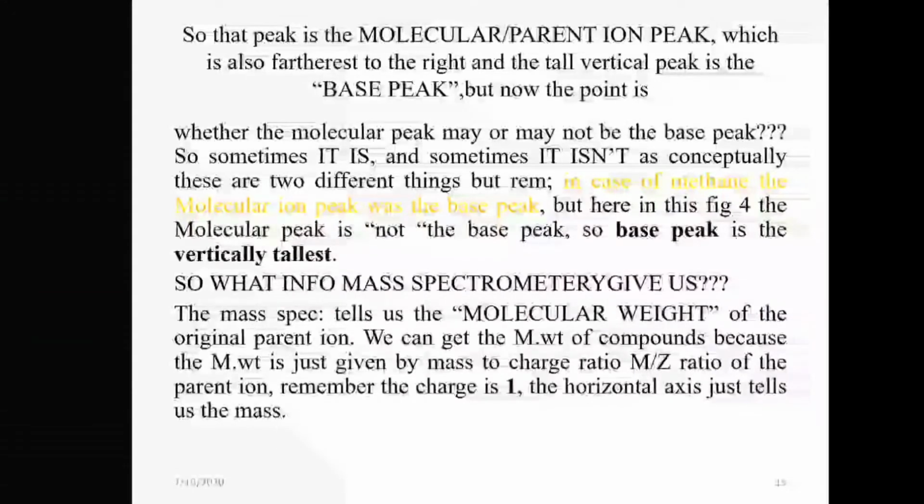But now the point is whether the molecular peak may or may not be the base peak. This is a question. Sometimes it is and sometimes it isn't. Conceptually, these are two different things, but remember, in the case of methane, the molecular ion peak was the base peak, but here in figure 4, the molecular peak is not the base peak. So the base peak is the vertically tallest.